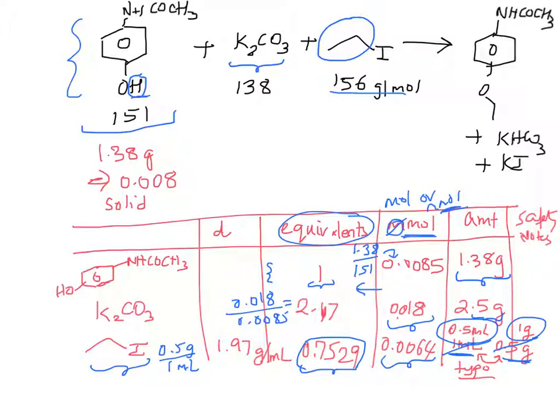And the solvent in this case, which is 2-butanone, has a boiling point of about 79, I think. So if that boiling point is true, you are heating this reaction mix above the boiling point of the ethyl iodide. And so some of that can get lost, even though we have the reflux. And so the cold water jacket is supposed to cool down the drops, but you may lose some of the material, and so your yields can be low.